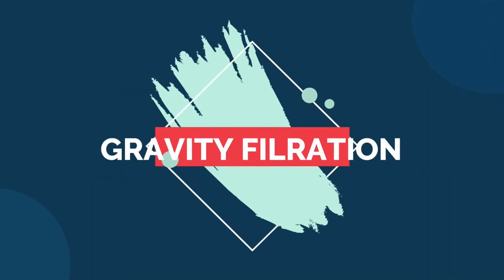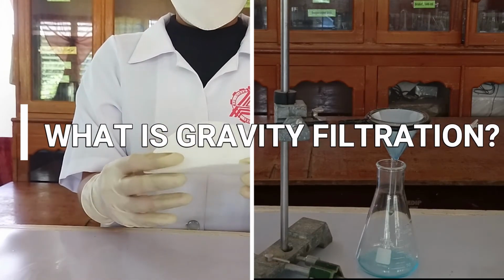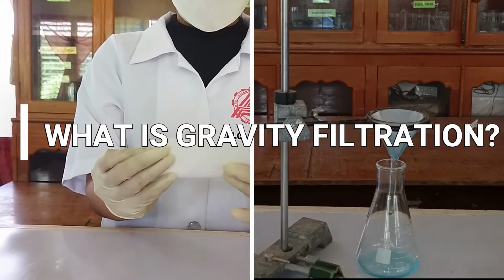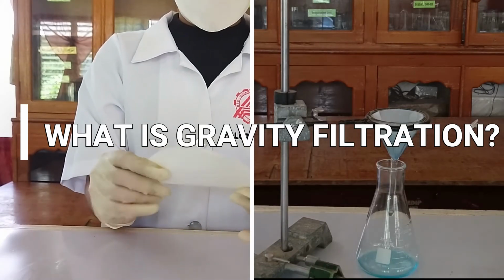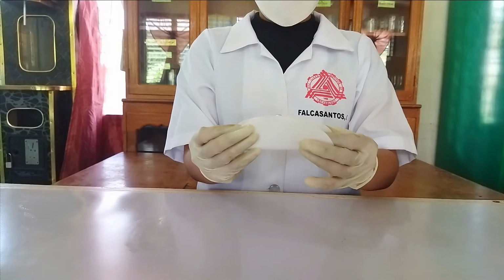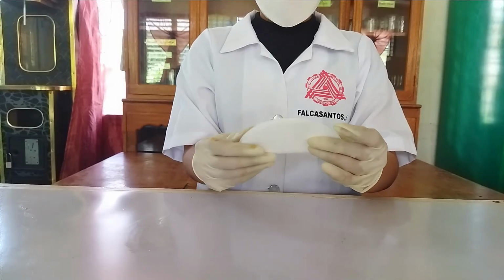Gravity filtration. Gravity filtration is generally used when the filtrate, which is the liquid that has passed through the filter paper, will be retained, while the solid on the filter paper will be discarded. To gravity filter a mixture, we will use a folded filter paper.